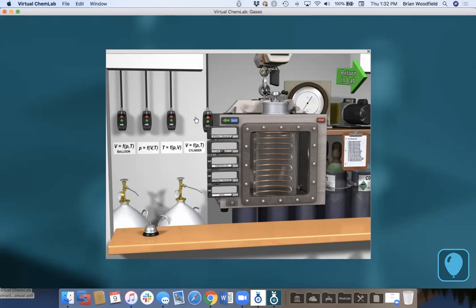Our approach is open-endedness, right? I want to allow for all the different realistic outcomes. I'm focusing on decision making, and we're going to put the story or the pedagogy outside the lab, outside the software, into these worksheets and lab activities. I'm trying to mimic what we do for real in real labs.